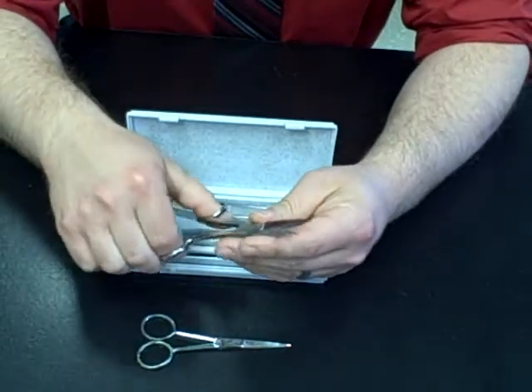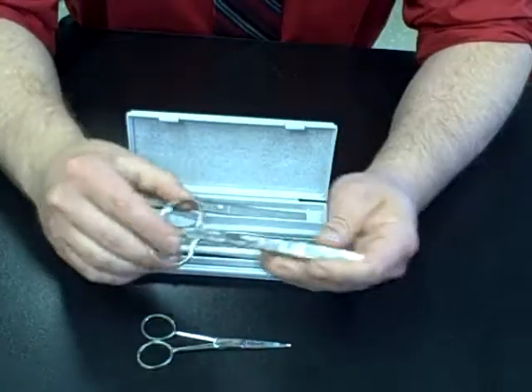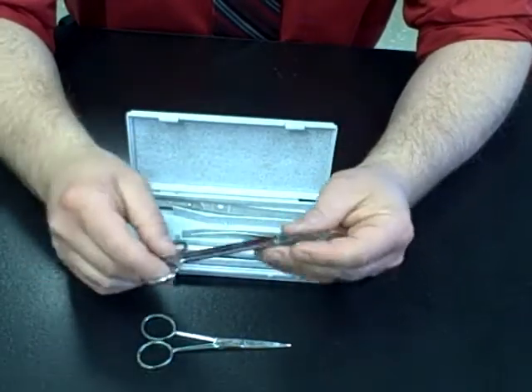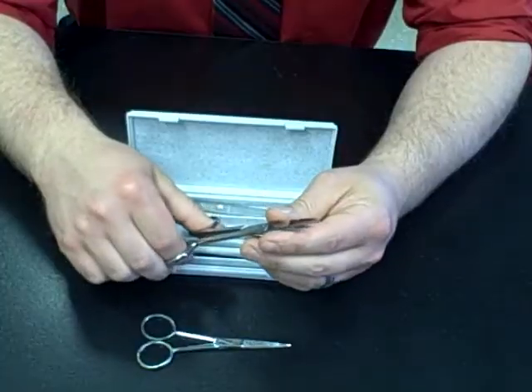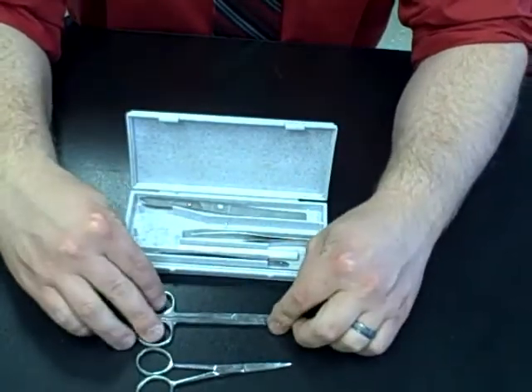These are your heavy scissors. This is good for cutting through the outside of organisms. For example, this will be very helpful when we're doing the squid, to cut through the outside of the mantle, which is kind of thick. These are good for heavy cutting, but not great for precision. If you need precision, go with the smaller dissecting scissors.